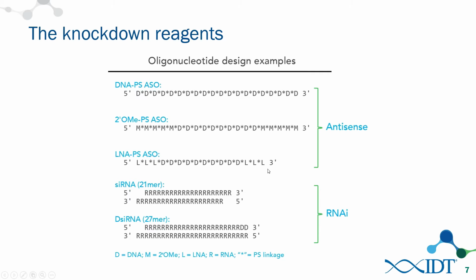And when you do that, it allows you to shorten the oligonucleotide, and so that's why these ones are about 15 to 16 mer in length. Shortening an oligonucleotide can help with cellular uptake, as well as minimize the cost of producing it. But basically, that's what LNAs are used for: to enhance the binding affinity of an oligo.